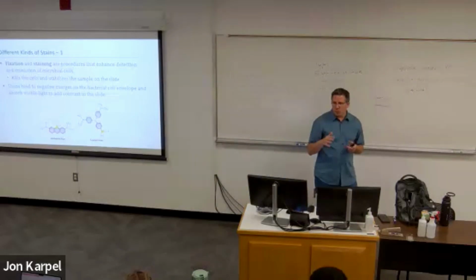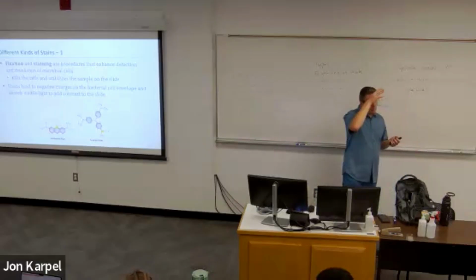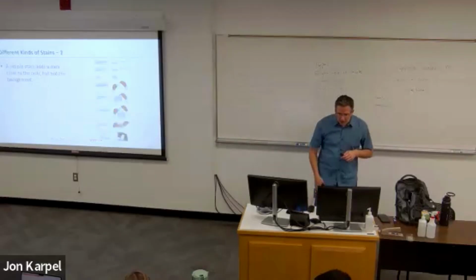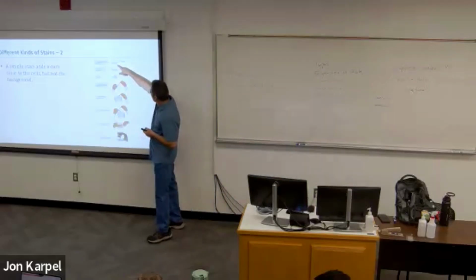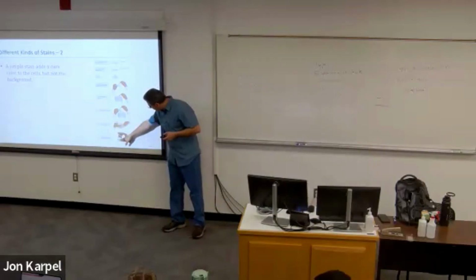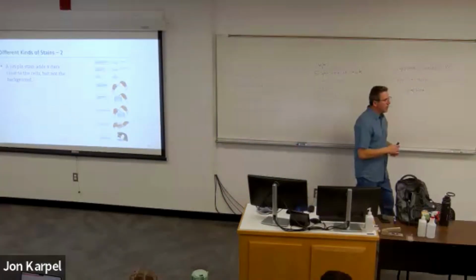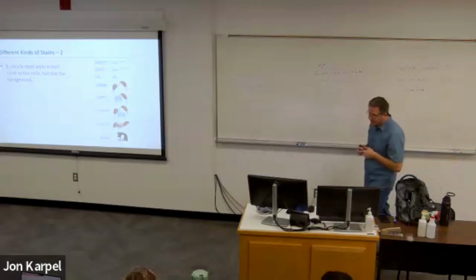And then we'll do a couple of different stains. We'll do a simple stain, and then we'll do a gram stain in the lab. And the stains will help us see the cells better, okay? So here, this is the steps I just talked about. So you put the sample on there, heat them or air dry, and then you're going to go through the staining process. And then sometimes you put a cover slip on there, sometimes you don't need to. Other times you can just take the slide and look at them directly, okay?